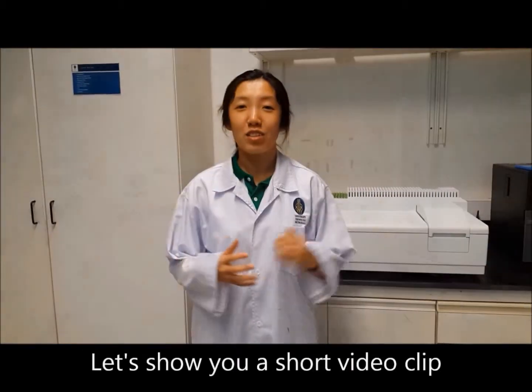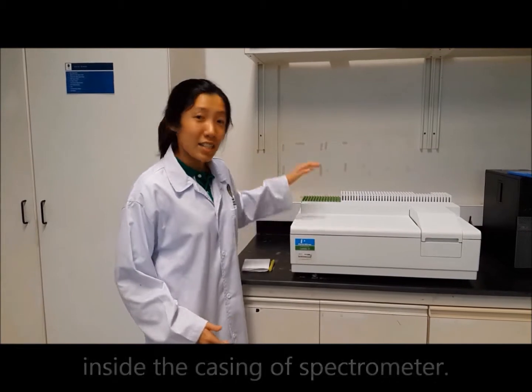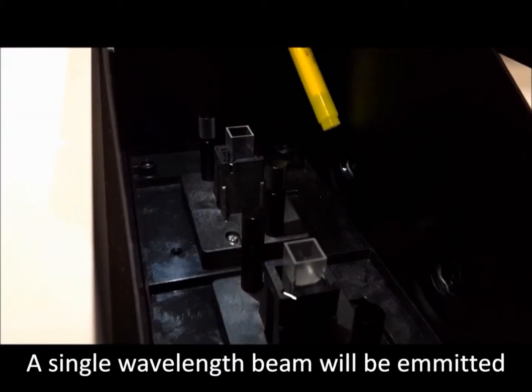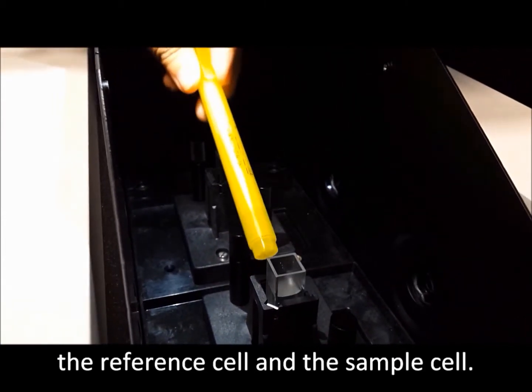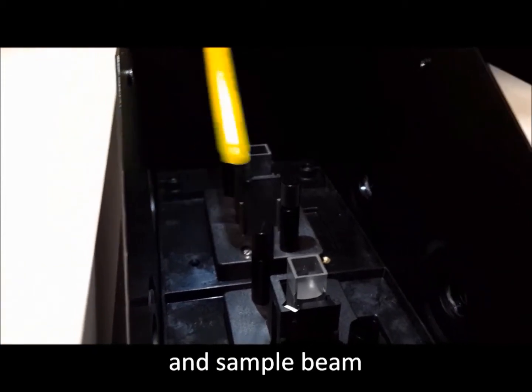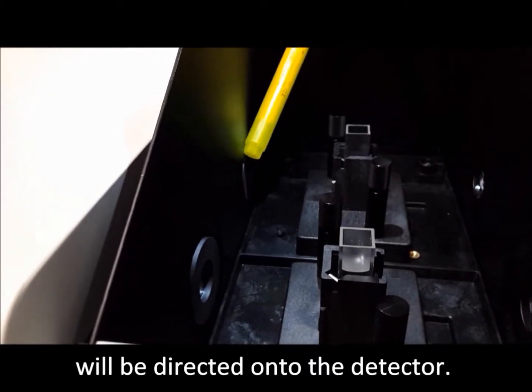Let's show you a short video clip that shows you the operating process inside the casing of the spectrometer. A single wavelength beam will be emitted from the source here, and the other side is here. Then the beam will be passed through the reference cell and the sample cell. After that, both the reference beam and sample beam will be directed onto the detector.